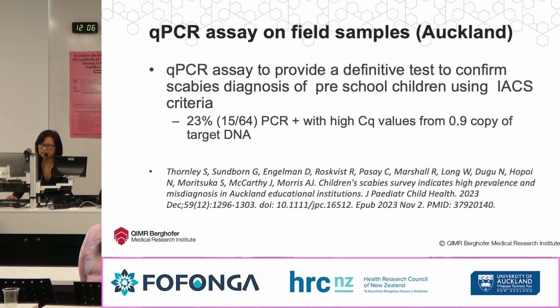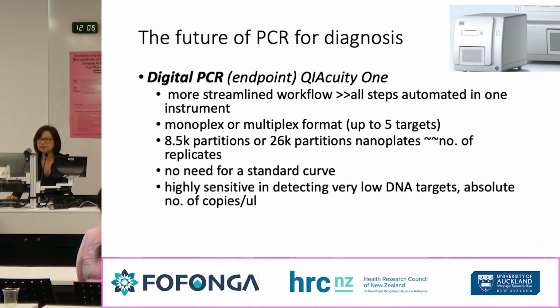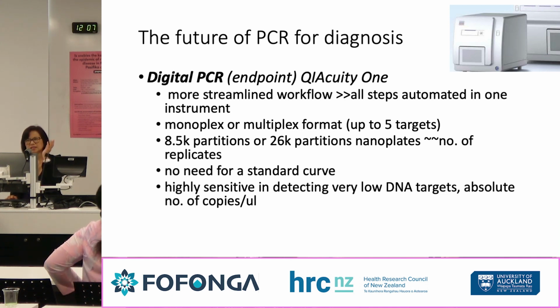So we've made significant improvement. What else can we do so we can increase the sensitivity? So today I'm going to take you to the latest in PCR diagnosis, and this is the use of the newest upgrade of qPCR, which is called digital PCR. Digital in its sense means there's only a positive or negative result. You can only go positive or negative, that's it.